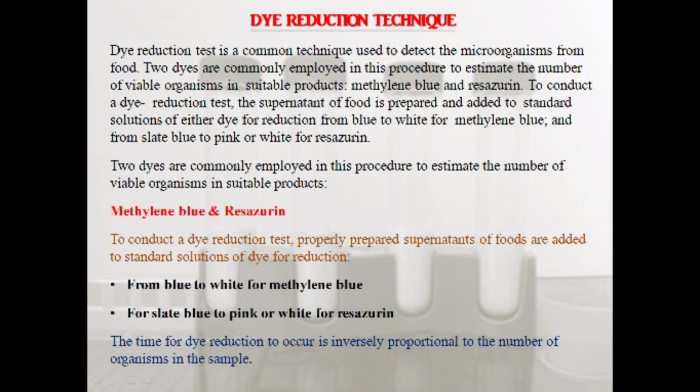The time for dye reduction to occur is inversely proportional to the number of organisms in the sample.